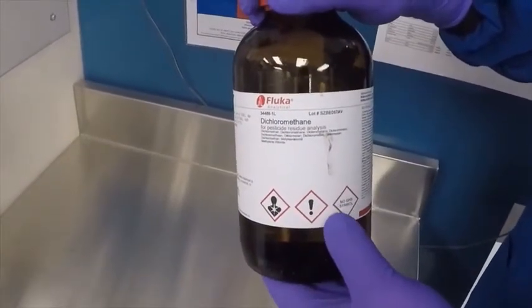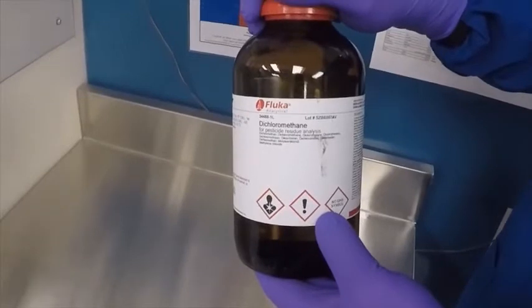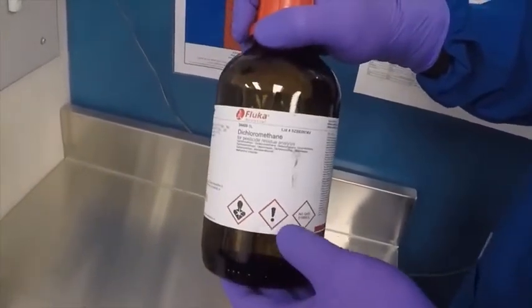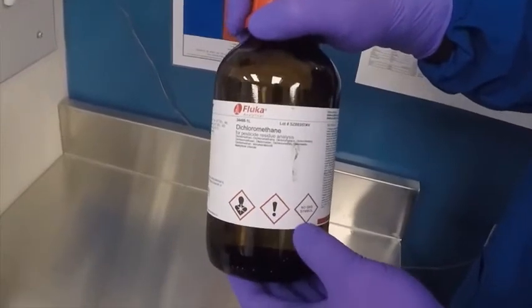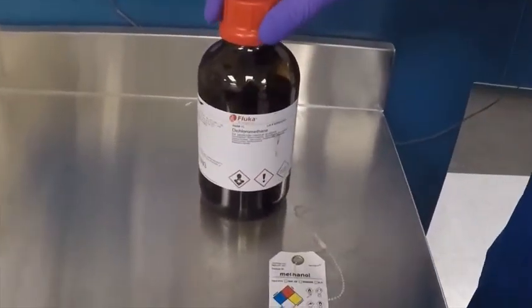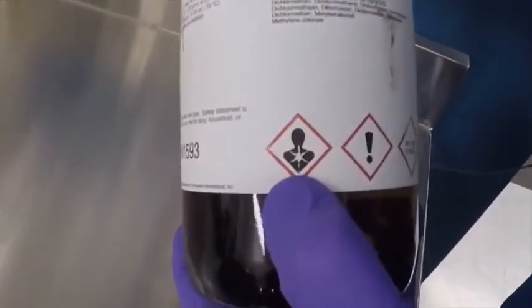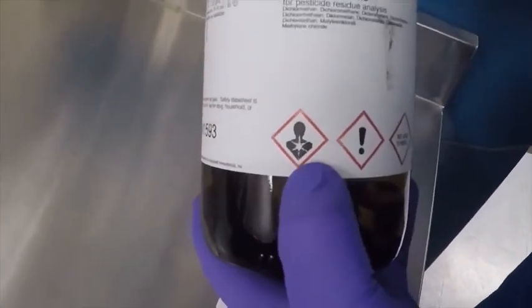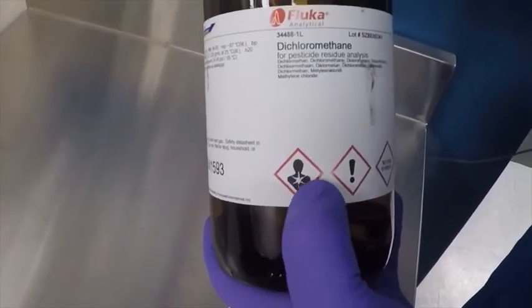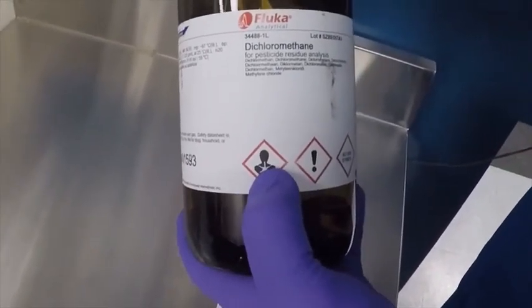This system was designed for global use — no matter where you go in the world, these symbols all mean the same thing. For example, on this bottle of dichloromethane, the first symbol — the silhouette of a person with what looks like an exploding chest — is the symbol for toxins. The exclamation point is another symbol indicating other toxic natures of the substance, and it'll be listed on the SDS.